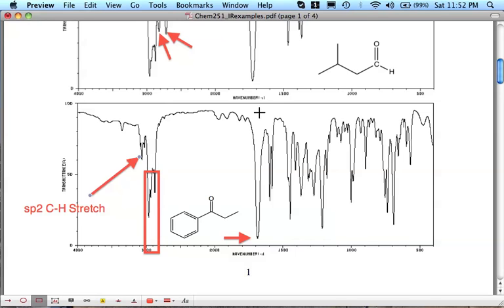So let's just do it this way. I'm going to go right from about there to there. That region in there is our normal aromatic region. And again, I want to emphasize that usually there's one right around 1600, and then there are multiple other ones, 3 or 4, and they'll come in slightly different places depending on the aromatic ring and the substitution, but usually that's very distinctive.